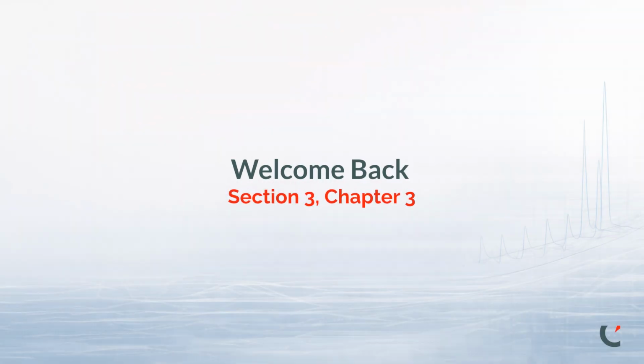We are now moving on to Chapter 3 of Section 3, where we are learning how to work with chromatographic data inside the Analyze program. In the previous chapter, we introduced the Analyze environment and learned how chromatogram files are opened and displayed. We also discussed how Chromperfect manages raw data and bound files, and how multiple chromatograms can be loaded for analysis.